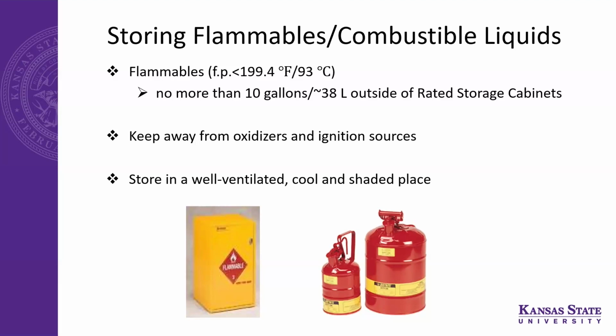Yeah, and for our Zoom listeners, the question is oxidizers, flammables, and I think we're talking compressed gases, correct? The normal NFPA storage is 20 feet apart, but you'll actually be amazed, you can segregate that. So I would rather look at the operation itself. There are barriers that you can put in place. But again, I would look at it from an overall risk management perspective and look at it closely before we can give you a definite answer.